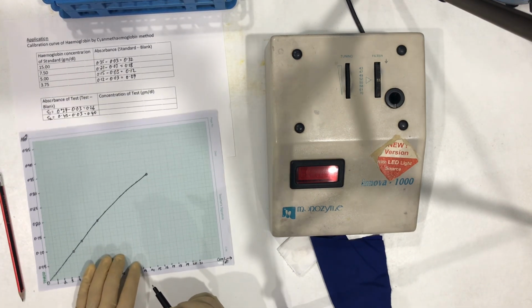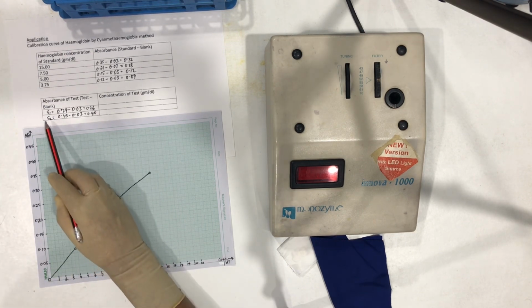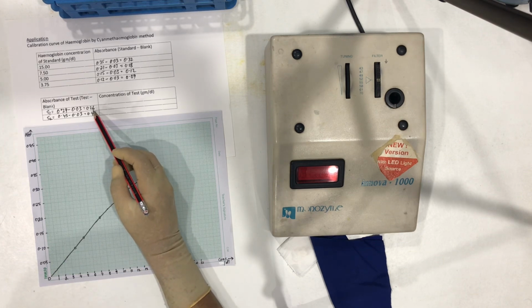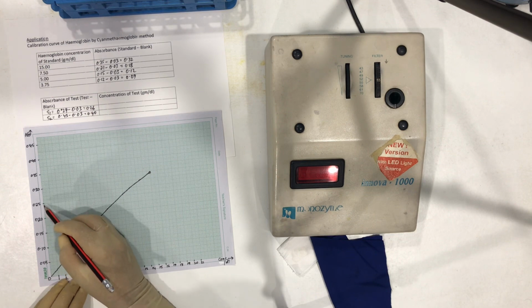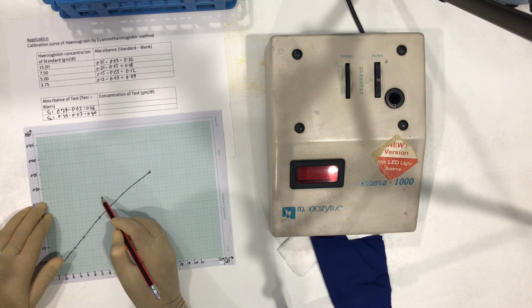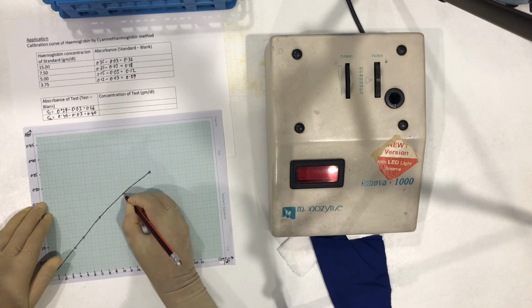Now let us find the concentration of our sample. So sample S1, it is giving an absorbance of 0.26. This is 0.2. Okay, 0.25. So 0.26 is going to be out here. So if you go straight, it is out here.